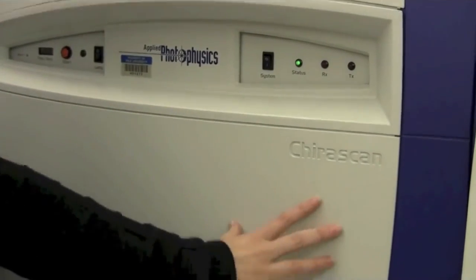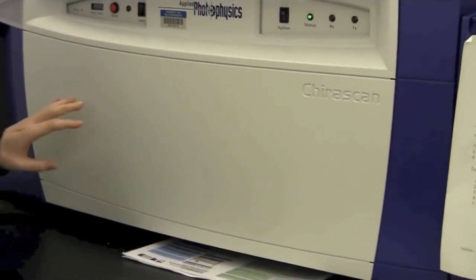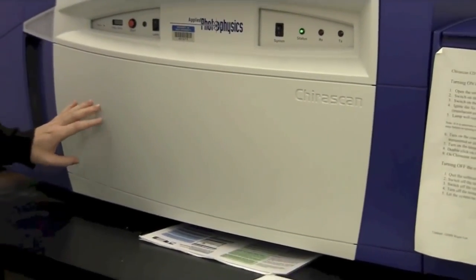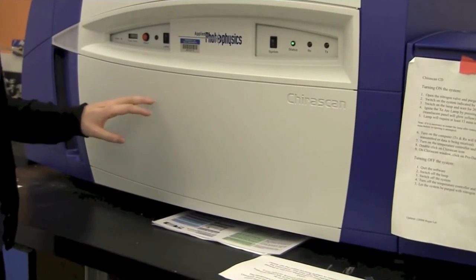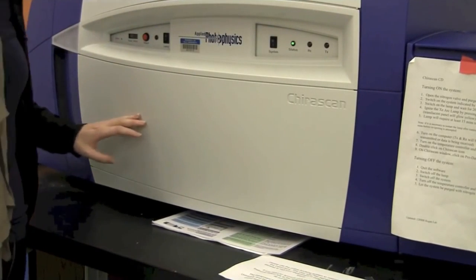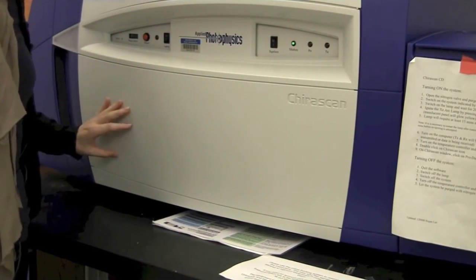Underneath here there is the monochromator. The monochromator is a dual prism linearly polarizing monochromator.